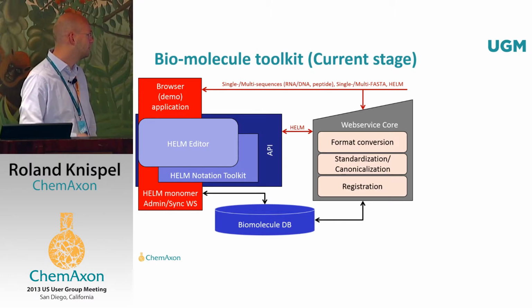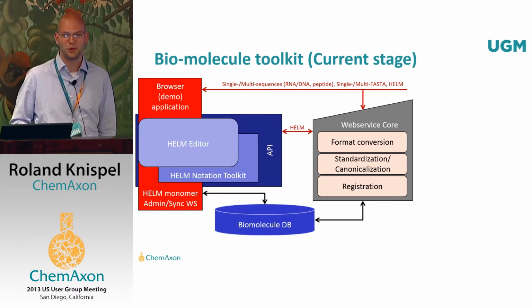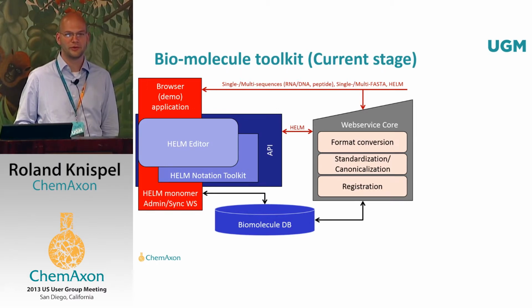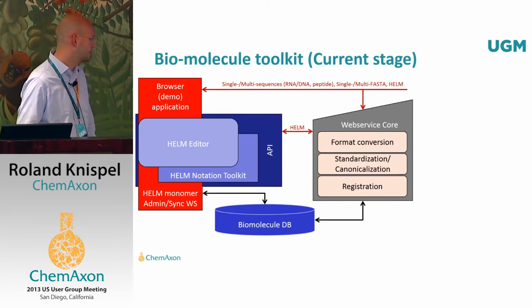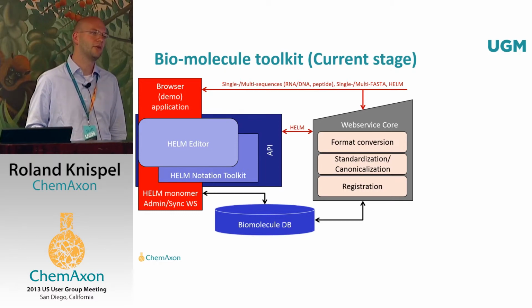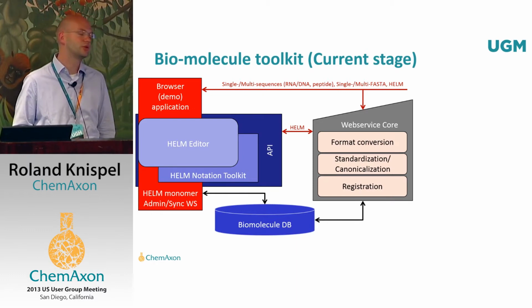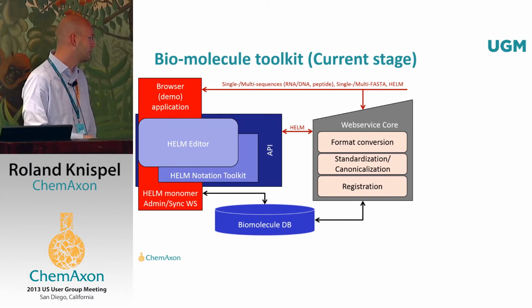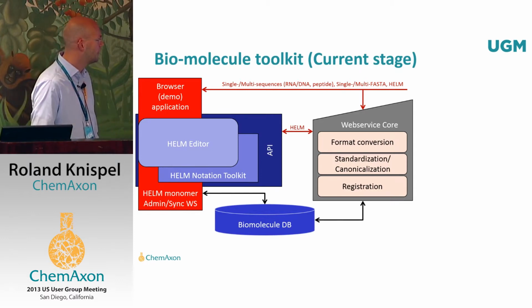We've also put up what I call a demo application. Essentially, it's like our testing site where we can test all of our services for functionality. But we are soon looking at integrating this with our regular registration system. At the same time, we have integrated some helper service down here, which allows us to manage the data required by the HELM notation language with our web service layer and the graphical user interface. But I'll go into the details about this a bit later.